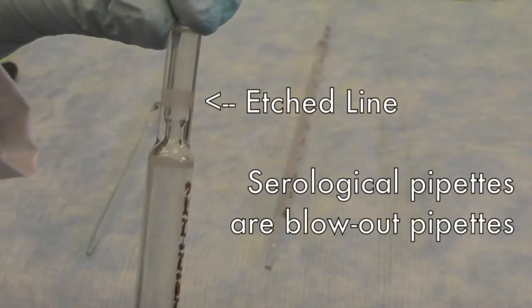Along with the edged line, serological pipette can be identified as blowout type. It indicates that the last drop of liquid has to be dispensed from the pipette for accurate volume delivery.